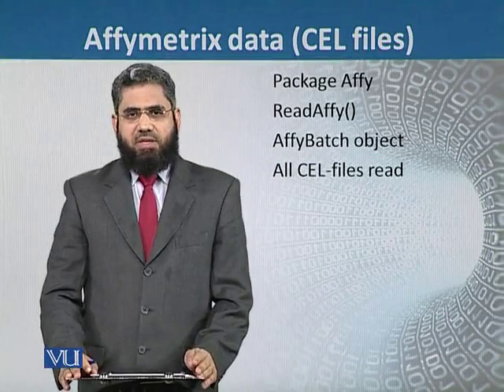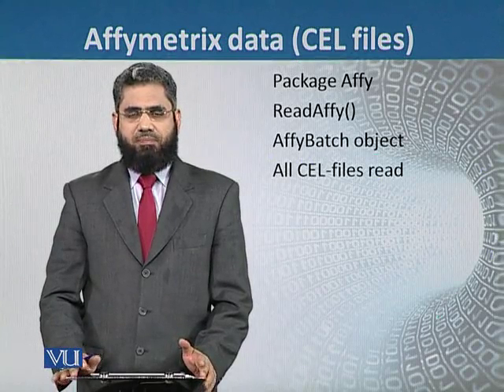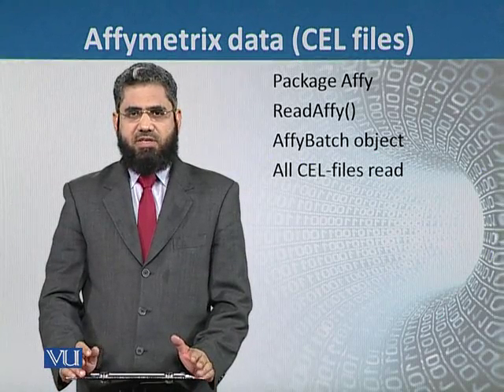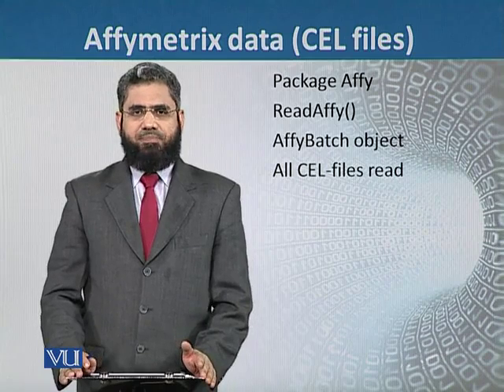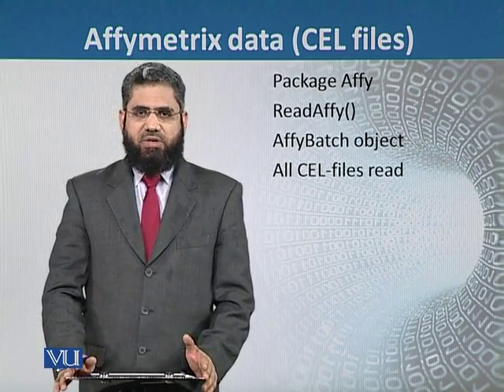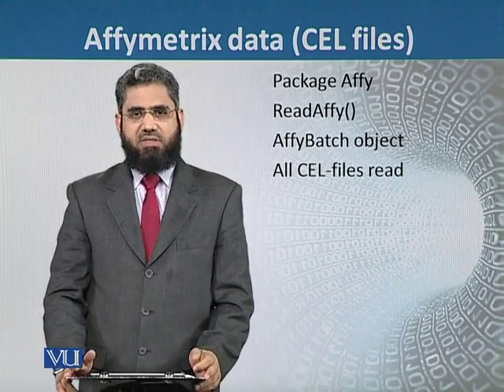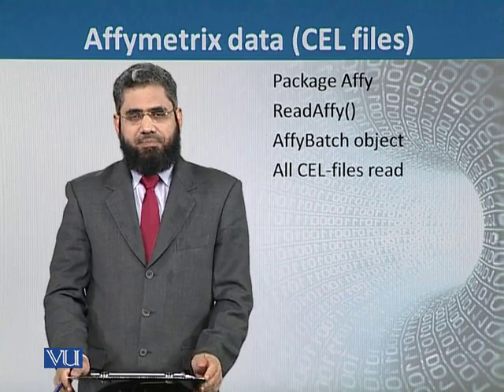From now we will see that our program can be used to visualize and analyze the data generated by the chips manufactured by different companies like Affymetrix, Agilent and Illumina.